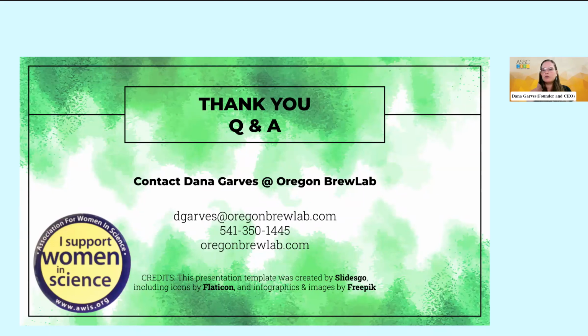What I did, and you can find this in my microwave talk, is compare media prepared in a pressure cooker versus prepared in the microwave, and found in most cases that the growth happened the same, although there is evidence, and in my experience, that some of the microwave media actually grows bacteria faster. But again, I recommend you check out my talk on that.